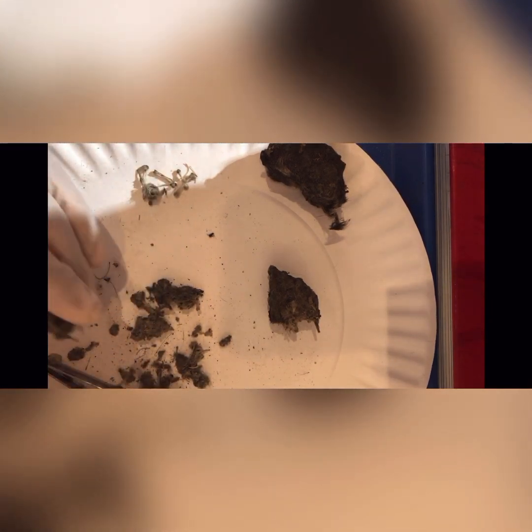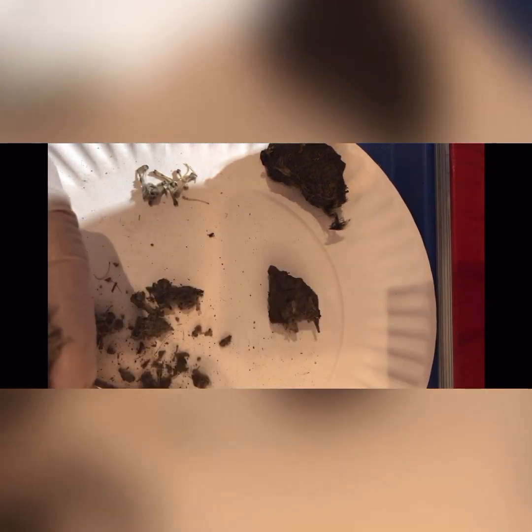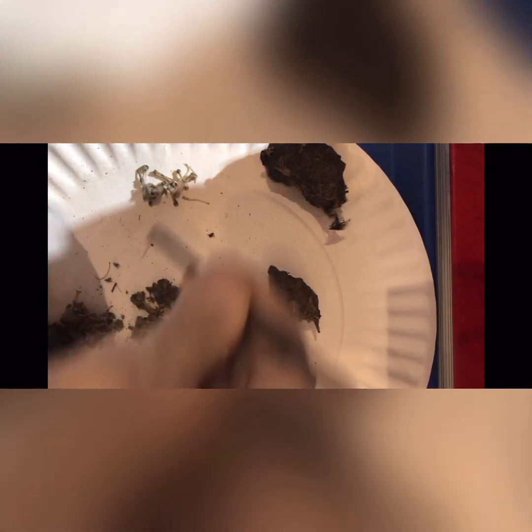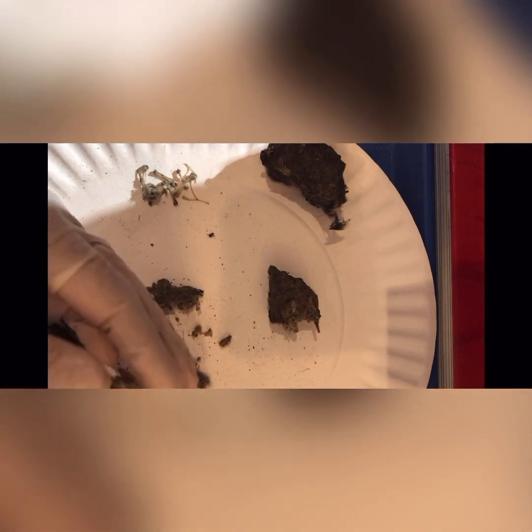Some of the bones are stuck in there, trying to dig them out. Oh, we have a bunch of little bones here. I'm going to move them all to the side. These are all going to be so useful later. Okay, let's put all the bones to the side. Oh, another fun bone. This is a really nice one. It's really exciting to find all the bones intact.